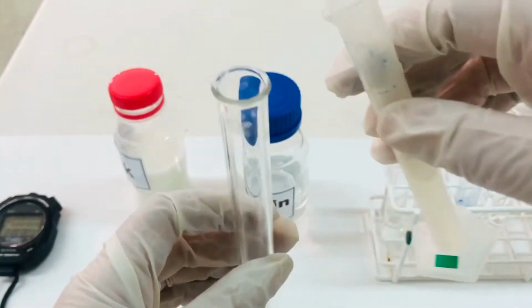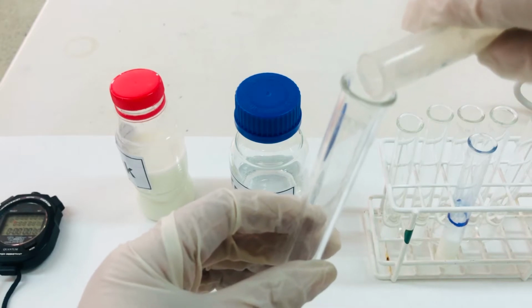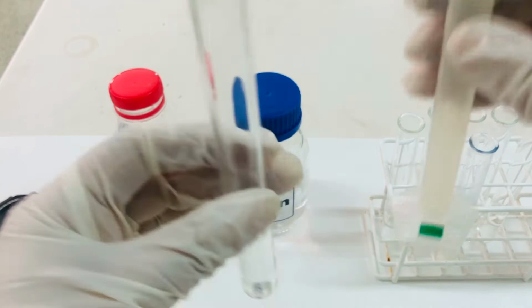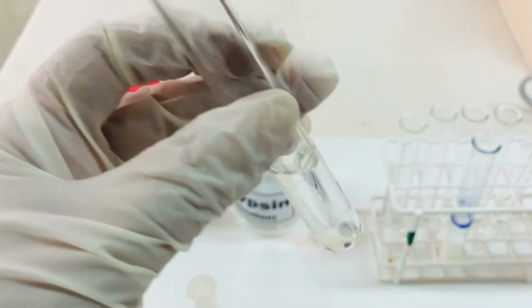We have used graduated cylinder to measure the volume. So, this is our 5 ml of trypsin.